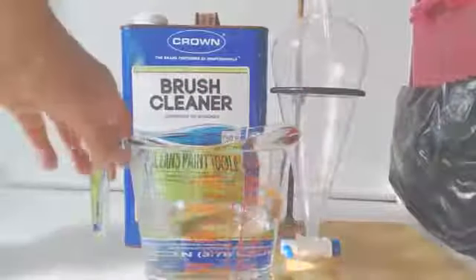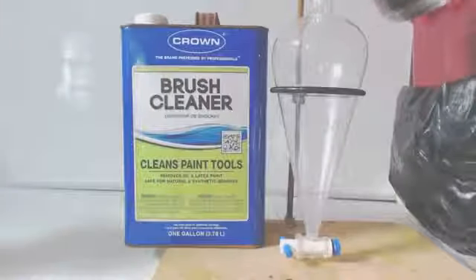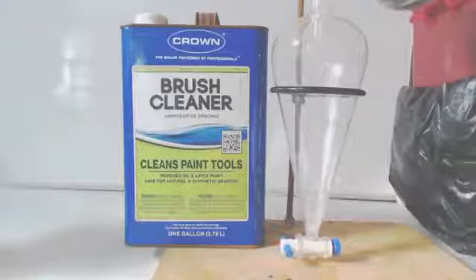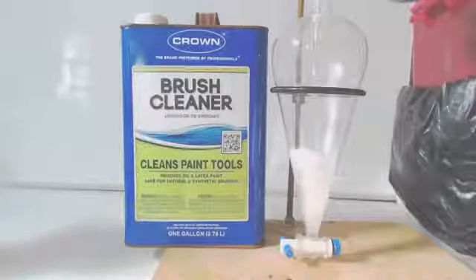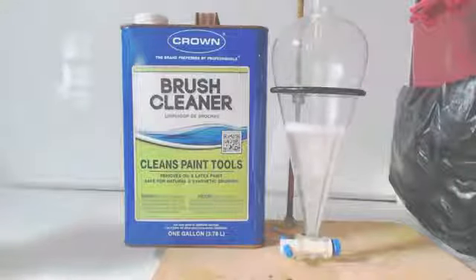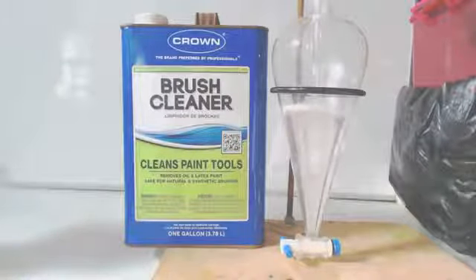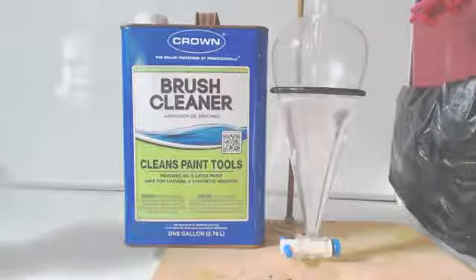This is John Black, Super Chemist. If you saw my last video, you'll see that I got some auto parts cleaner and I extracted the toluene out of that. I got about 16 milliliters of pure toluene. Let's see what we get out of this. I'm going to use the same amount, which was about 450 milliliters. So that would be how much is in a can of the auto parts cleaner.